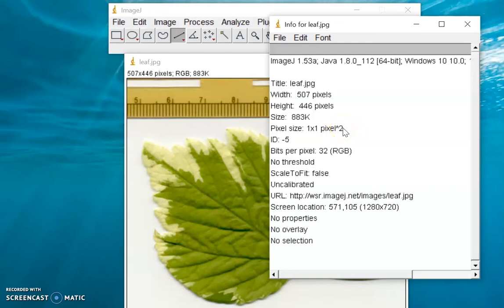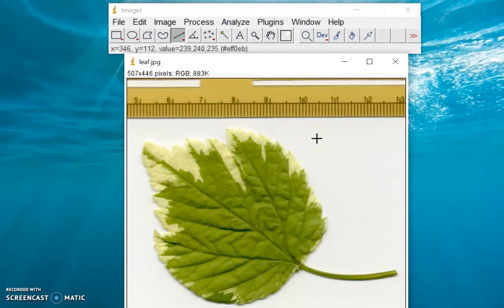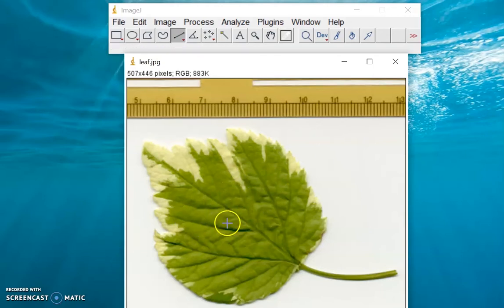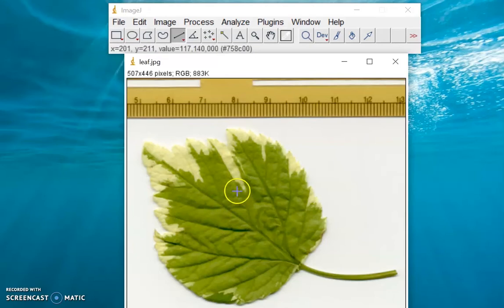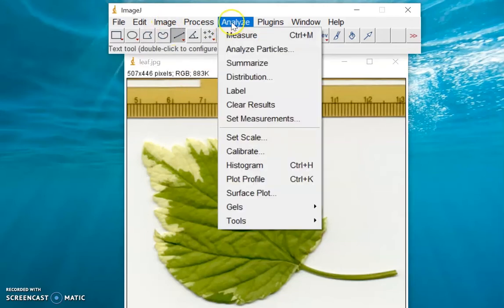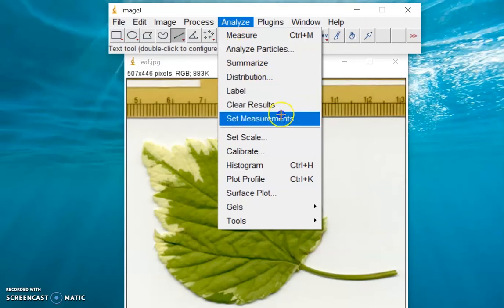This is important later in defining the pixel aspect ratio of our image. So I will now close this. By the way, this image is an example of a variegated leaf, so there is a variation in the color of the plant. This is due to the lack of the green pigment chlorophyll in some plant cells, and this is usually the result of cell mutation. So now let's try to set the measurement scale for this image.